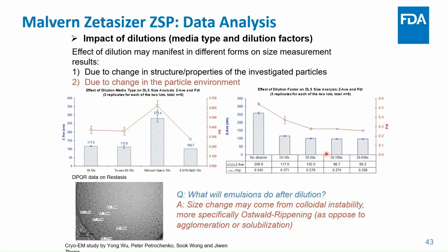When it's concentrated and you have some polymer in the system, your globules may be translating at a lower velocity because the localized viscosity is higher. So if you're assuming that the viscosity is close to water, you might be overestimating the size when you back calculate.